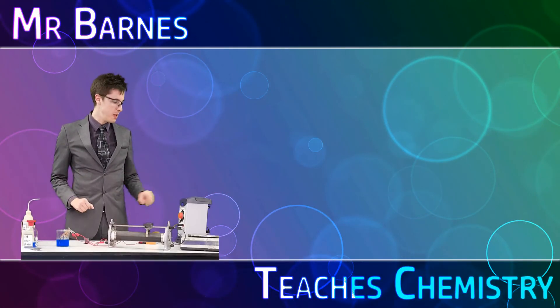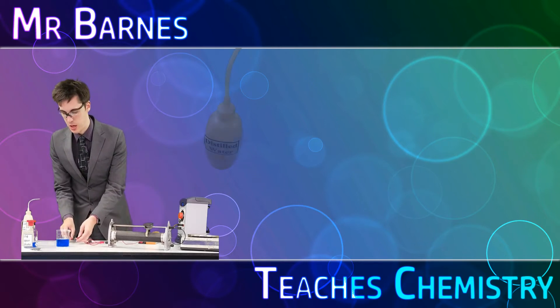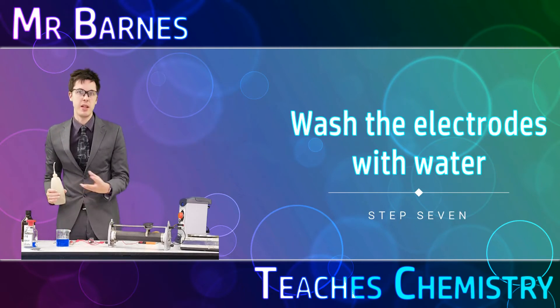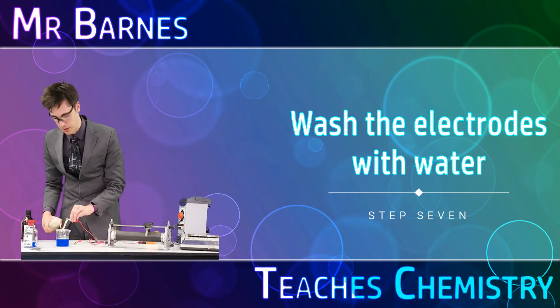It's now been 20 minutes so I'm going to turn my power pack off and remove the electrodes. My first task is to get a beaker and rinse both the electrodes to get rid of any remaining copper sulfate from them. I'm going to rinse both of them with a bit of distilled water.